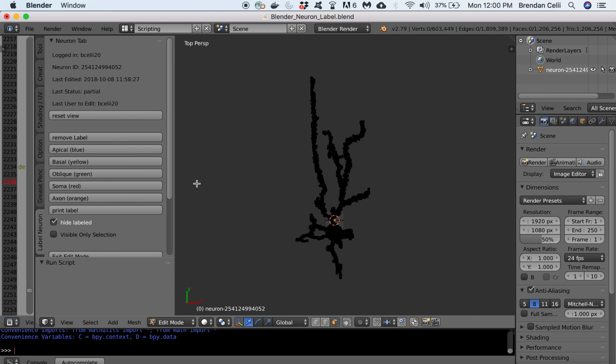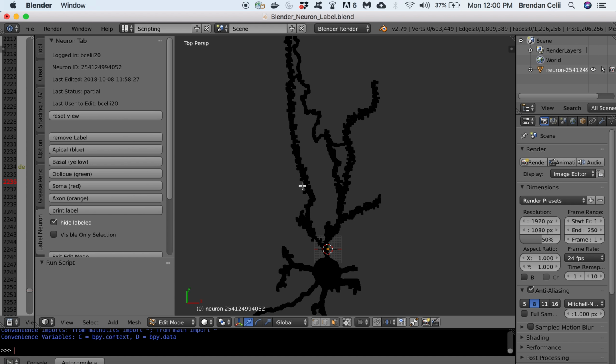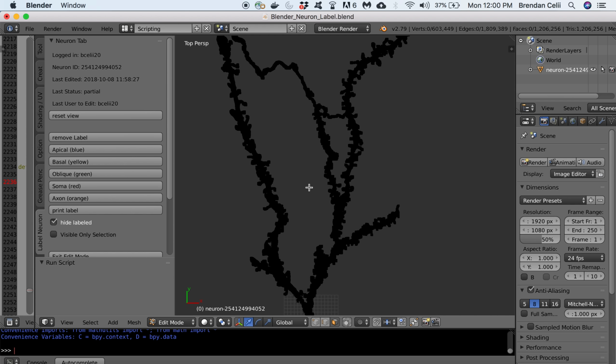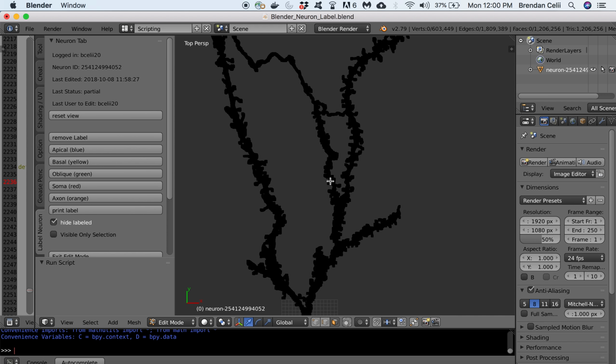Okay, so this is when it's going to convert it to edit mode. Edit mode is a little clunkier because it has to render all these little faces. So if you use your zoom in, you'll notice it'll probably be a little slower. The deal is, say you're looking at stuff, there are these little faces and the rendering's really slow.